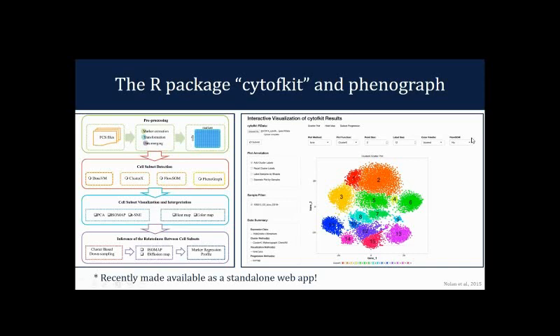You then run through a cell subset detection algorithm. Specifically, we use FlowSOM and PhenoGraph. FlowSOM is generated particularly for CyTOF data, and I believe PhenoGraph was also. So these are both really good software for looking at the interrelatedness between cells and then doing this kind of clustering downstream. These clusters are visualized in t-SNE plots for the most part, which gives us a nice way of plotting out the relationship data of the clustering algorithms run prior.